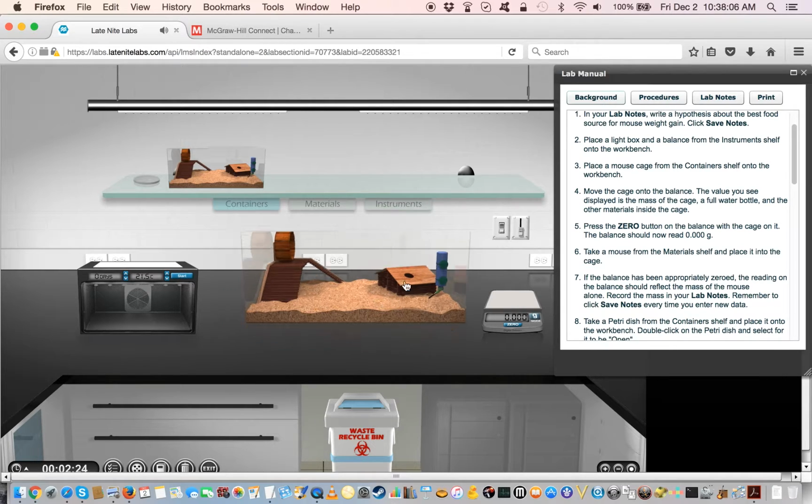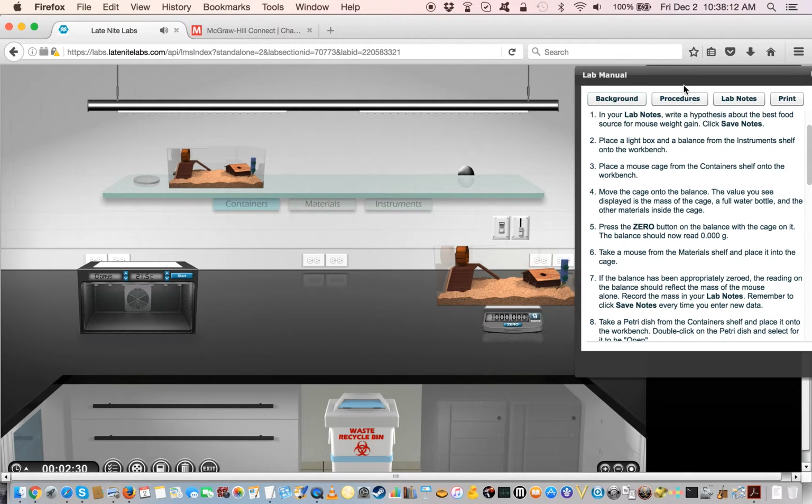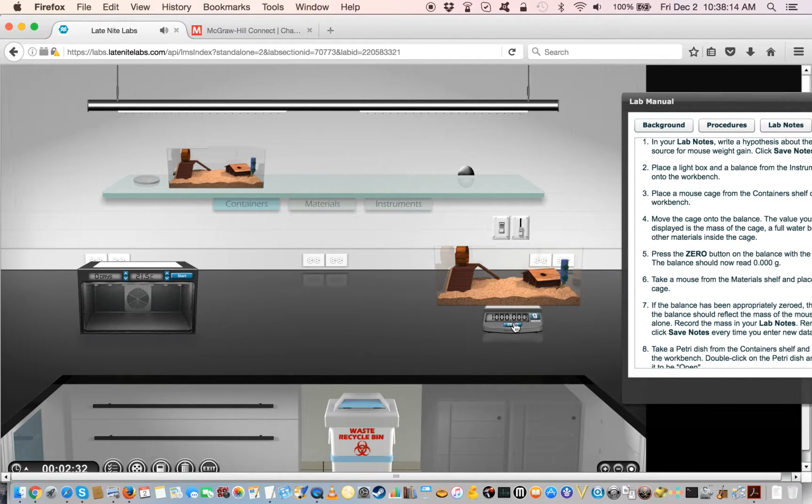The next thing I'm going to do is weigh the cage. Now what's going to happen is that the cage is going to weigh something. In this case it weighs 1000.000 grams. Now we don't really need to know the mass of the cage. It's going to be pretty much the same in each case, I imagine. But we're going to zero the balance and make it 0 so that when we stick a mouse in, we'll be able to weigh just the mouse. And that's all we're interested in at the end anyway, is just the mass of the mouse after it's eaten its food.